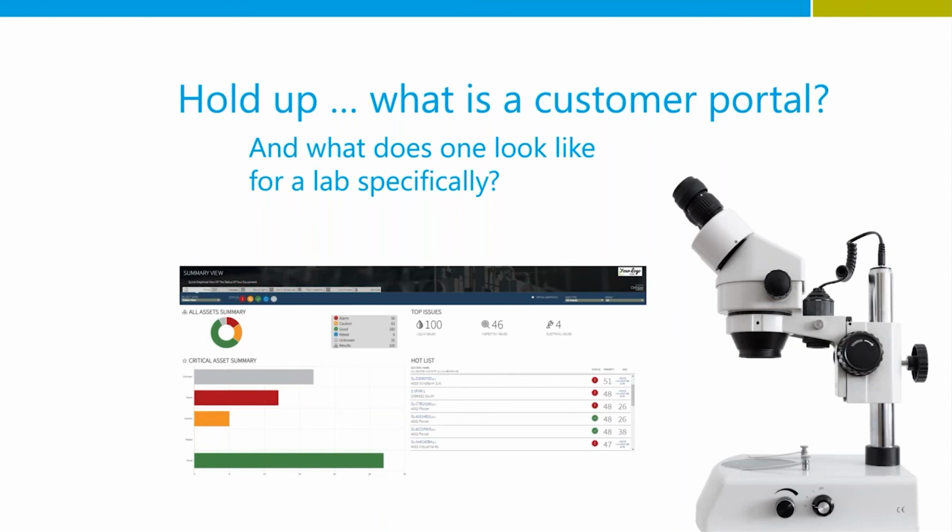Some of the cool things you can do with the portal too is you've seen some of the postal service trackers where it lets you know when the package was shipped, where it is along the process, so you can provide better insight of the customer's sample data going through your entire process. So they have a good idea of when that is going to become immediately available within their portal. And then there's other tools you can do, such as graphing, allowing customers to analyze their own data so they can pick one data point that they might want to review, and they can look at its current data value and then maybe go through the 10 years past to see what's going on. So it's a lot more interactive than just the printed version. That's what I believe to be a customer portal.